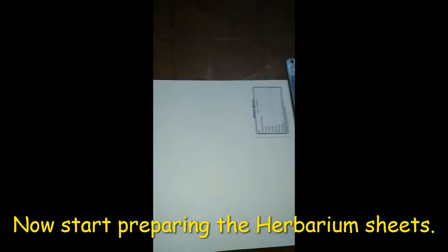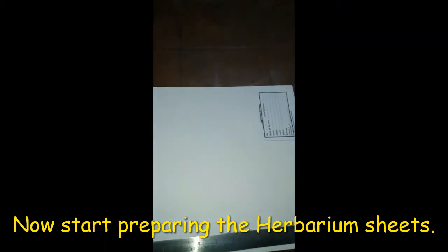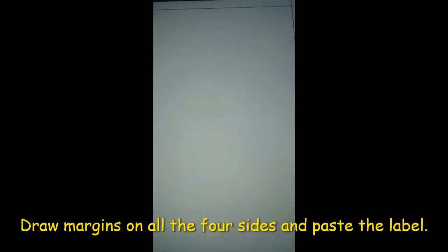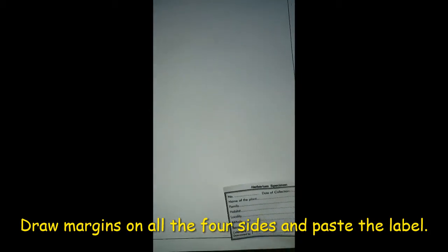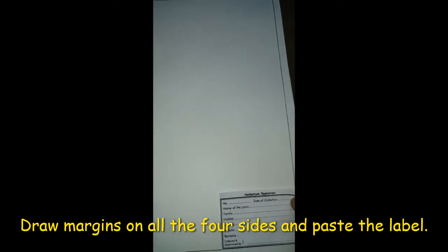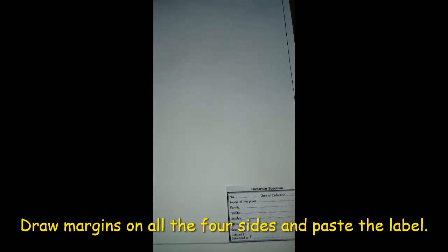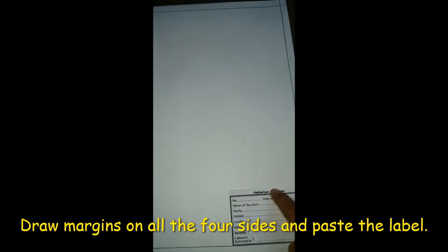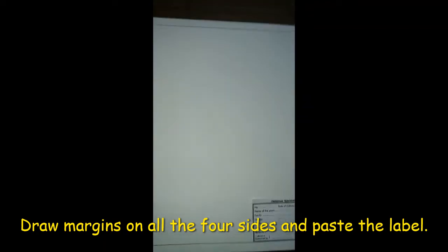To begin, use a scale and draw margins on all four sides of the sheet. After drawing the margins, paste the label suitably on one end of the paper — you can also draw the label by hand or use ready-made labels. This is how our herbarium sheet will look once the label is in place, and now the sheet is ready for transferring the specimen.